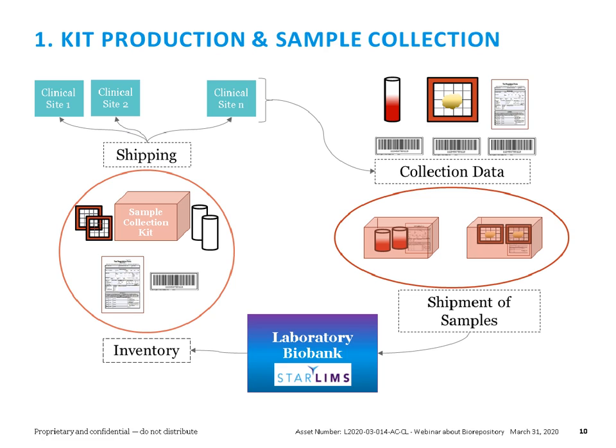But the kit, what makes it unique is that you need to define what the components are that will be part of this kit. And when it comes to the components, you can have different sample containers that you want to have in your kit. And you may also want to have barcode labels printed for your containers. And also there could be the need for a paper requisition form that will be attached to the kit.